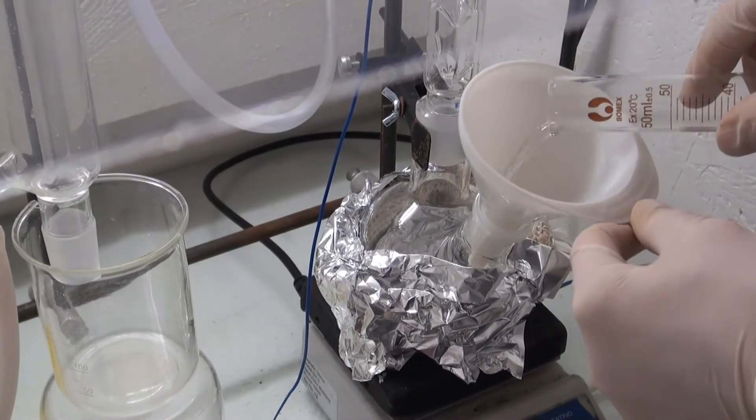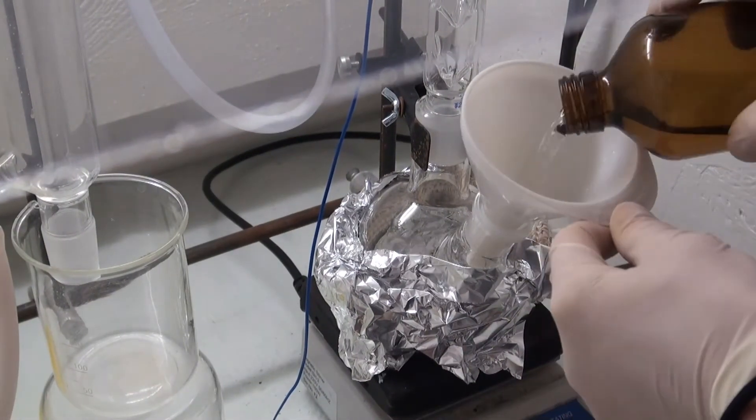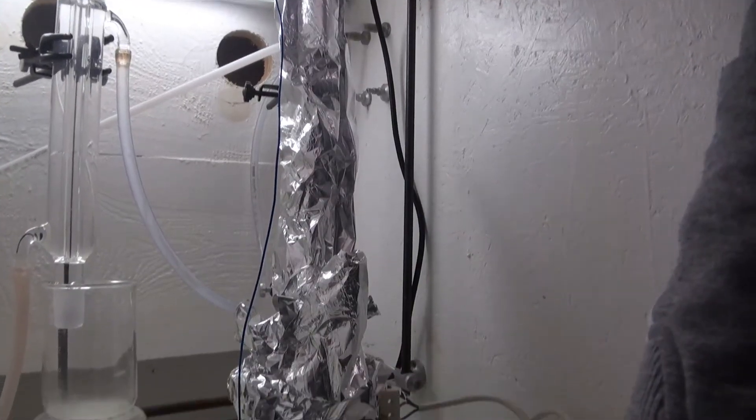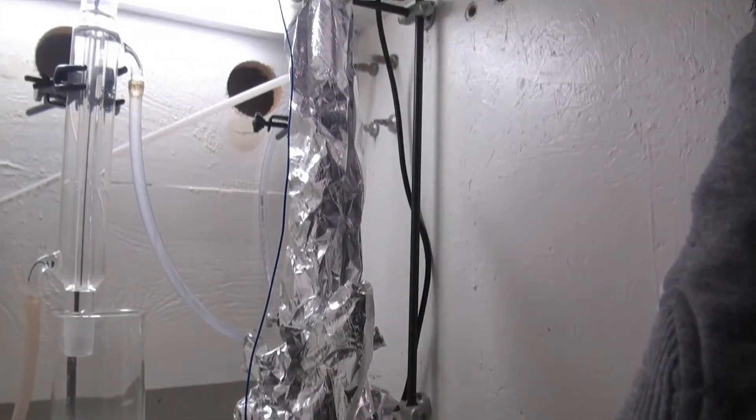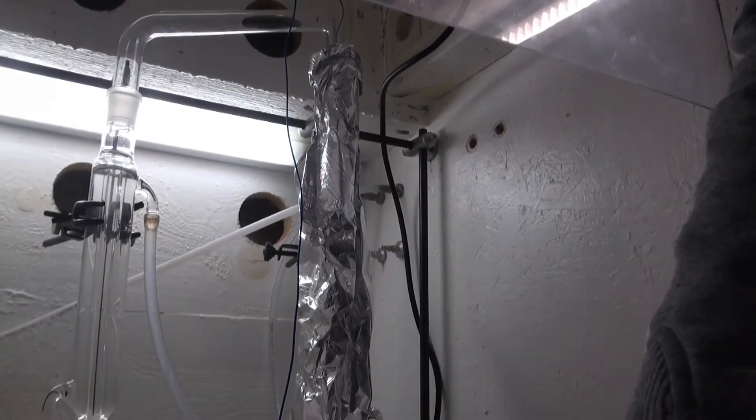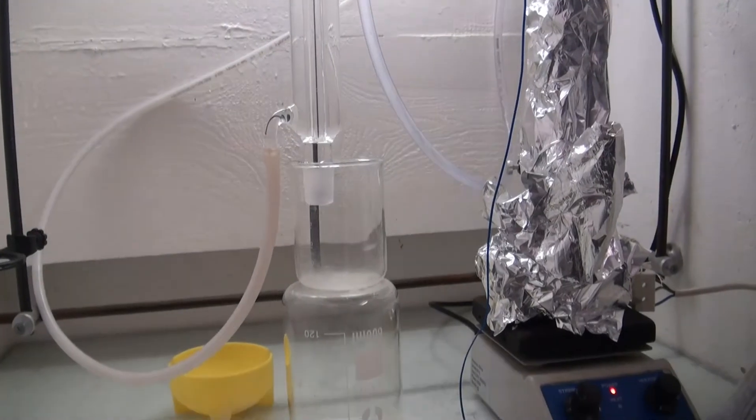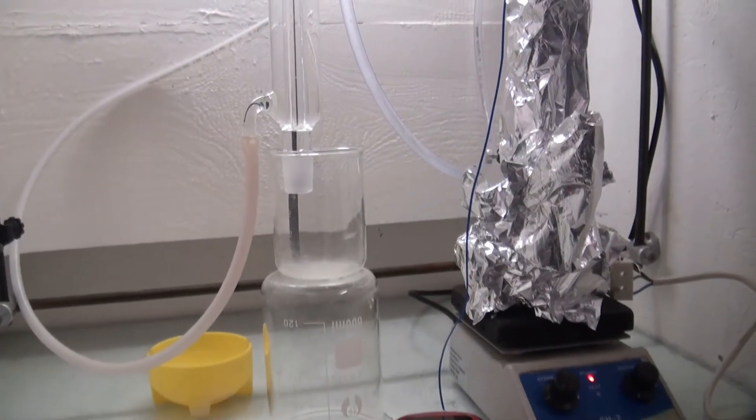The acid was added to the flask and the heating was started. The flask and the column were wrapped in aluminum foil to isolate it. But it was important not to wrap it too much, because this could reduce the effectivity of the fractionating column.